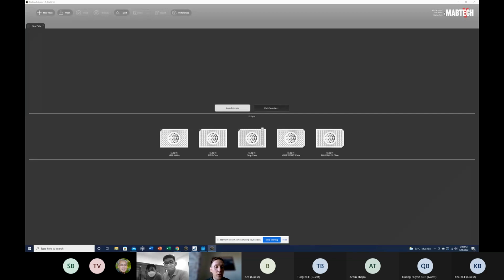Yes. So then I would like you to go to Preferences in the top menu, and Reader. And here we can find the identity of the ASTOR, and it's saying ASTOR 61, right? Yes. And then it's also saying some MD values, so some machine default values. Can you read out the value for MSIP white for me, where it's like a light gray text?